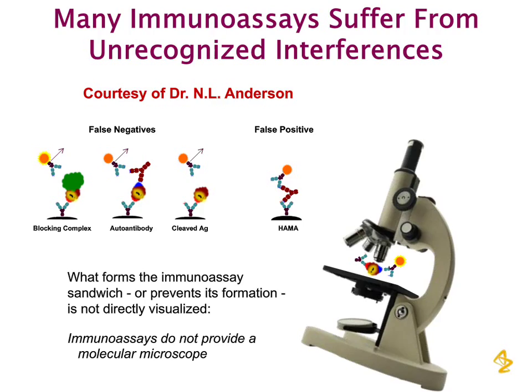Having said all this, I want to emphasize that immunoassays indeed are a valuable analytical tool once they've been validated. They are remarkable in being capable of quantifying proteins at the low picogram per milliliter level in undepleted human plasma with the presence of other proteins that differ more than 10 orders of magnitude. Mass specs of today, no matter how sophisticated they are, cannot compete with immunoassays regarding LOQs.